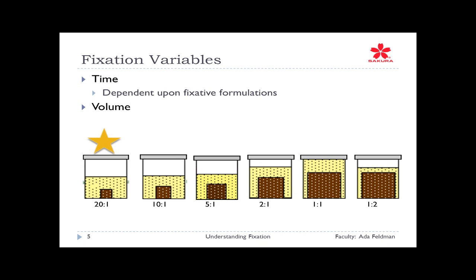Because remember, the tissue is filled with serum proteins and lipids. And what's happening with the specimen as soon as it's put in? The fixative is going in, and it's pushing out the liquids that are in the tissue. So don't think that while it's in that fixative you've got that much fixation going on, because the longer it's sitting in there, the more it becomes what I refer to as used fixative.